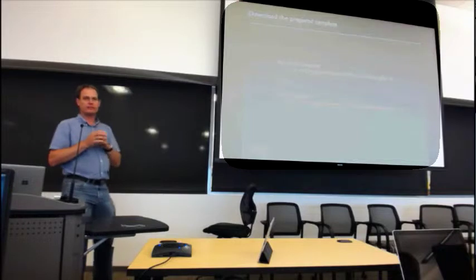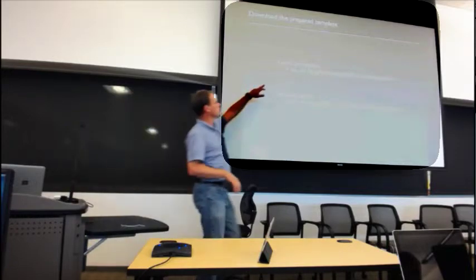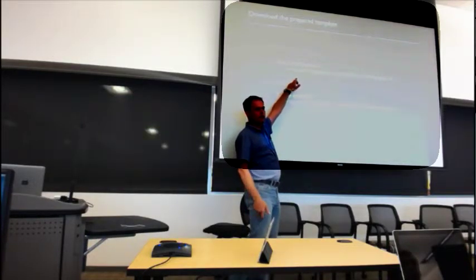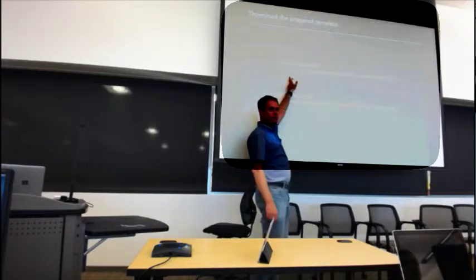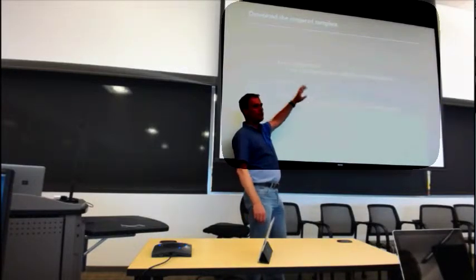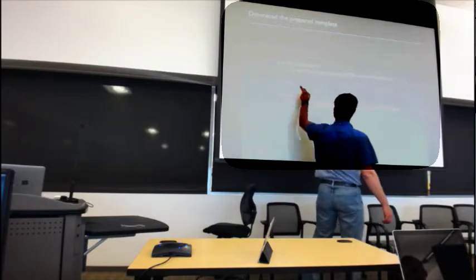And within that little directory that you create, that is going to be your private space, see if you can extract that file there, and it'll just pull out a bunch of standard configurations. In fact, in this directory here, there's a standard bare bones template that looks very much like this. This one I happen to have customized for this experiment, but a bare bones template that you can unpack basically sets everything up. This is also described on the website.